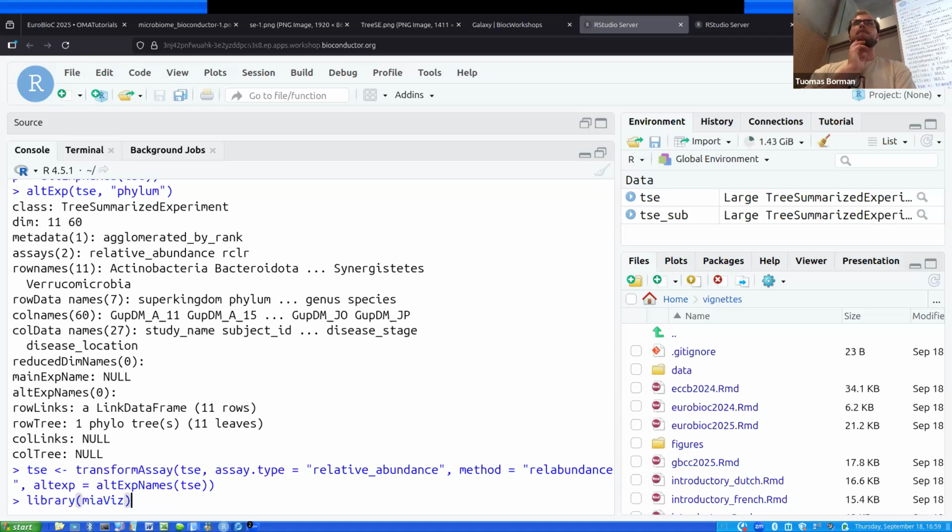I can multiply everything by 1 million, because after that I need to use some counts for statistical analysis. What I do by myself, I import from a table, I export a table as an assay, I calculate from a table, and after that I add the assay from external.